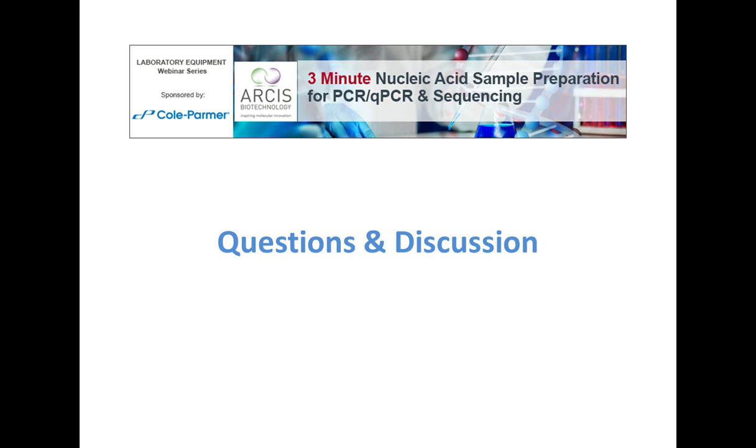And for people for whom 1:1 is still not good enough, we can do lyophilized reagents, which will completely eliminate dilution effect. But that's a non-standard product, obviously. The take-home message is the ratio is 1:4, but that can be scaled and changed to suit your needs in terms of sensitivity and yield.